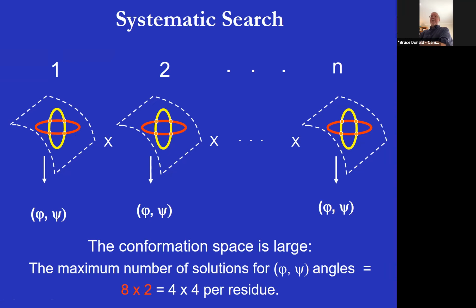So typically what's done is some kind of scoring system along the way. So you take the top things. Some of these solutions will be kinematically plausible, but not biophysically plausible. They'll cause steric clashes or be terribly far from the Ramachandran diagram. So typically you can prune this down quite a bit. But it's kind of remarkable that the data actually gives you a discrete search.